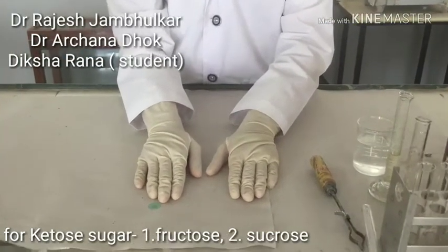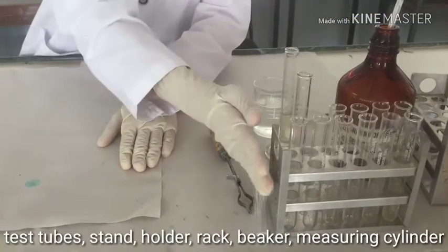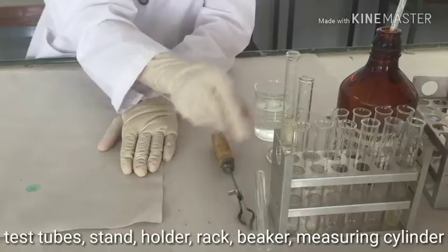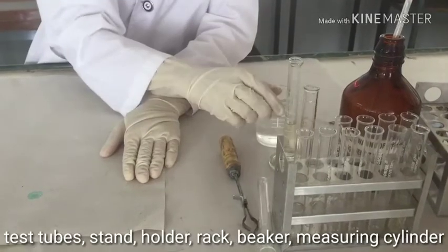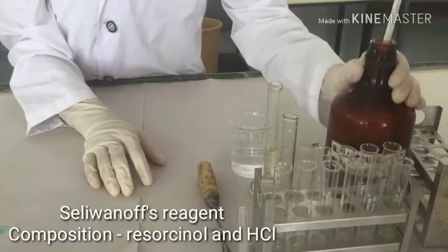We are going to perform the Seliminov test. The apparatus used for this test are test tubes, test tube stand, test tube holder, measuring cylinder, and a beaker containing sample. The reagent used for this test is Seliminov's reagent.